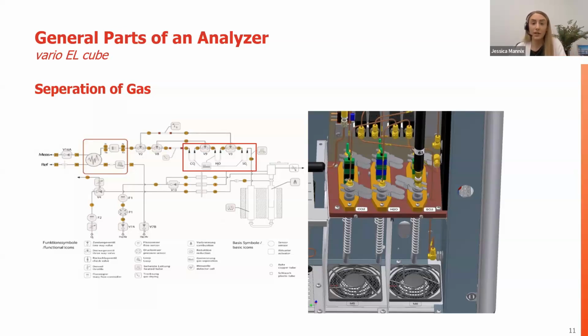The software then initiates a heat up function with the CO2 going first. You can see that column is the closest one to the detector. Makes sense. We'll heat it up, release the carbon gas, move through, heat up the hydrogen trap, release the gas, and then the last one will be sulfur at the highest temperature. So the software is actually smart enough and waits to the end integration point of each peak in order to ensure very good separation. And that's extremely important in high carbon nitrogen ratios, which we see a lot in agricultural samples.